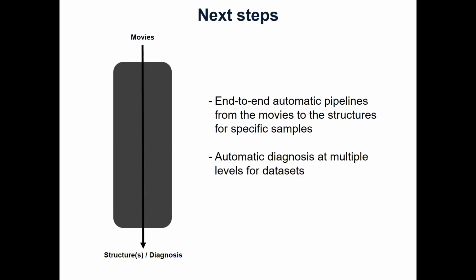Also, it will output automatic diagnosis at multiple levels: at micrograph level, at 2D level, at 3D level. So basically answering if this is a bad data set, why it is bad, and at what level. Probably that will assist the user in terms of better sample optimization.